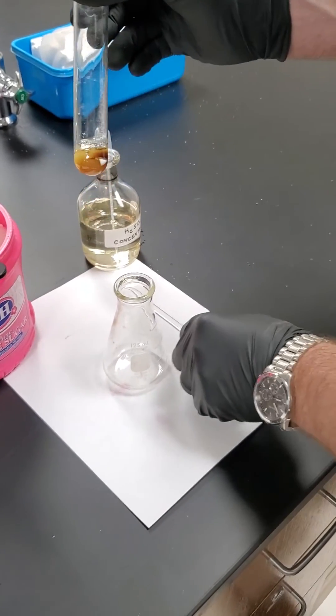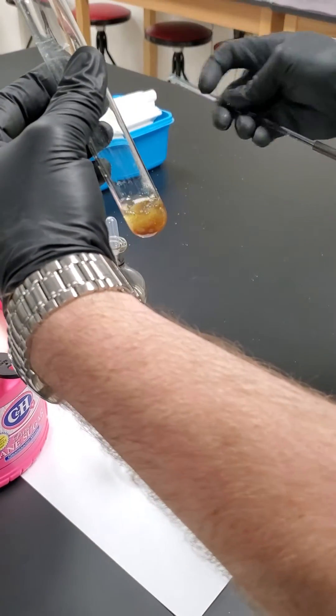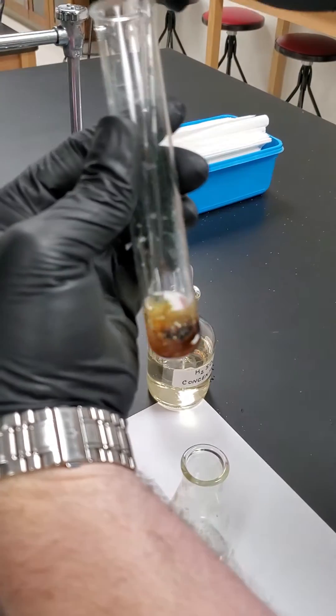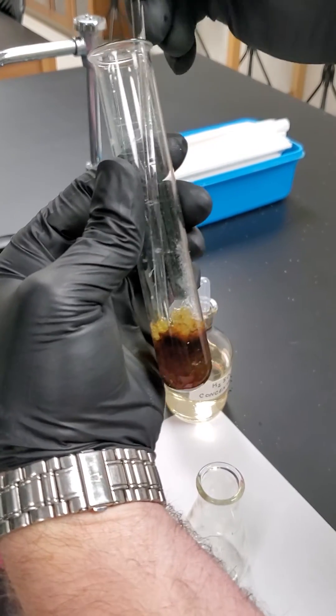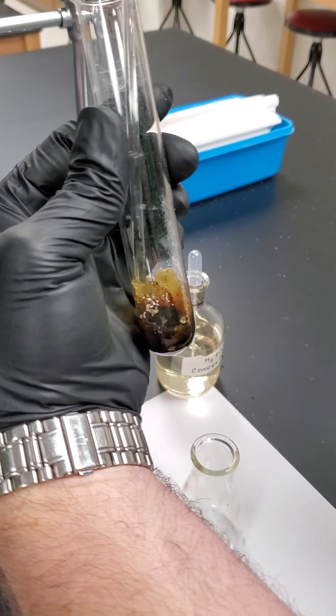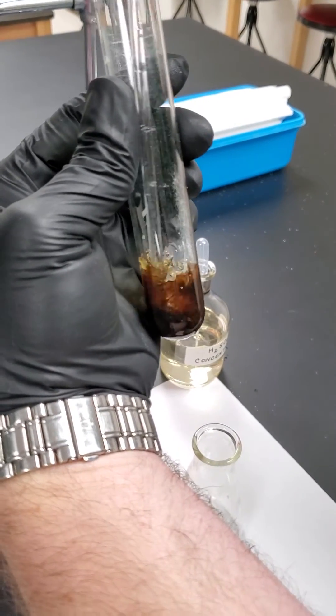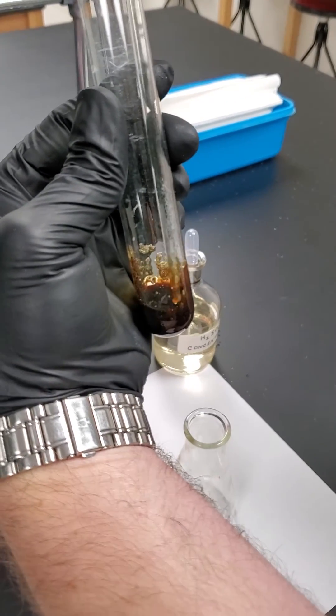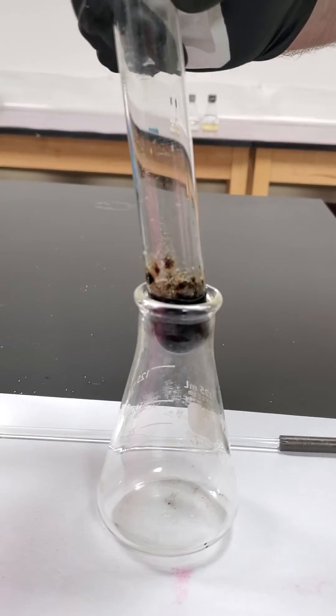Just notice now, just upon adding, starting to turn dark. Some yellow. Starting to discolor the sugar. Much like it would in our stomach with hydrochloric acid. As we stir it. Notice. Much, much darker. So we're going to let this sit a few minutes. And come back when there's a bigger change.